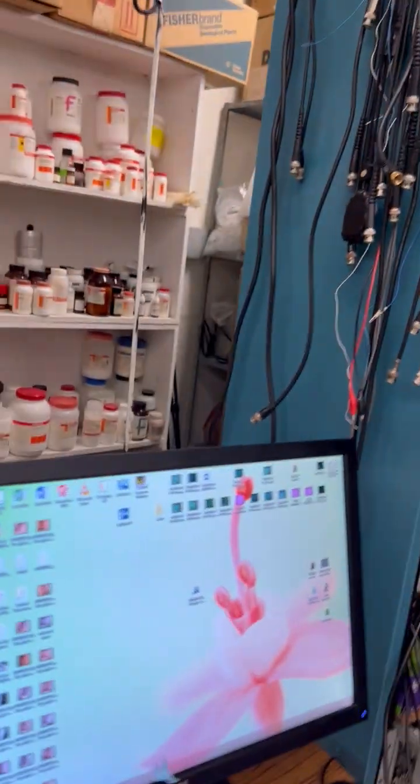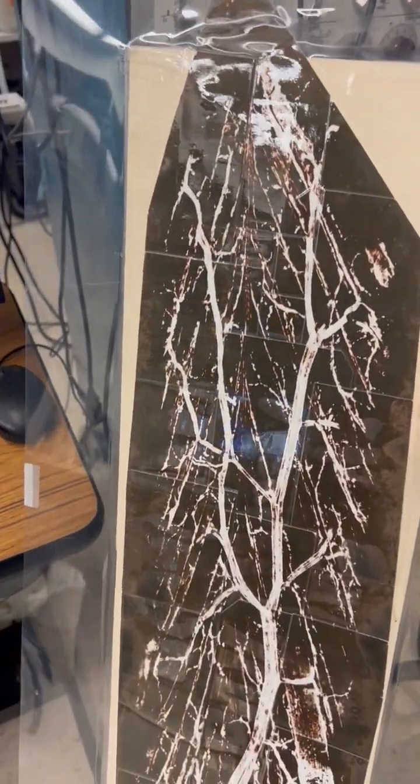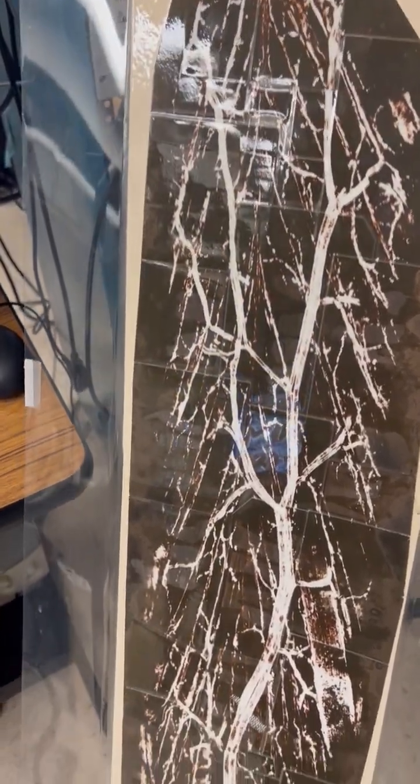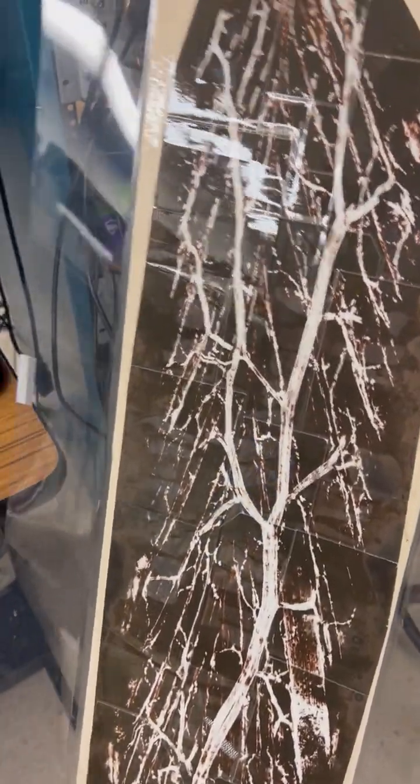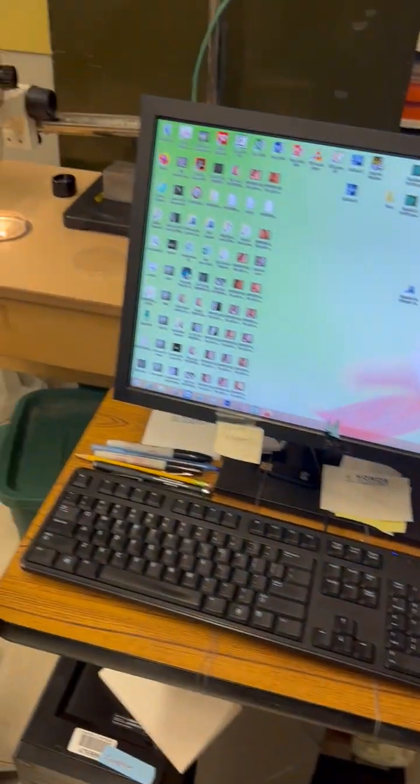And then we had a preparation over here on the opener muscle, and they could get an idea of why people use the opener muscle in the crayfish, because it's innervated by one excitatory motor neuron but lots of different muscle fibers. It makes it really easy to do some quantitative measures, and we had some traces going on there.